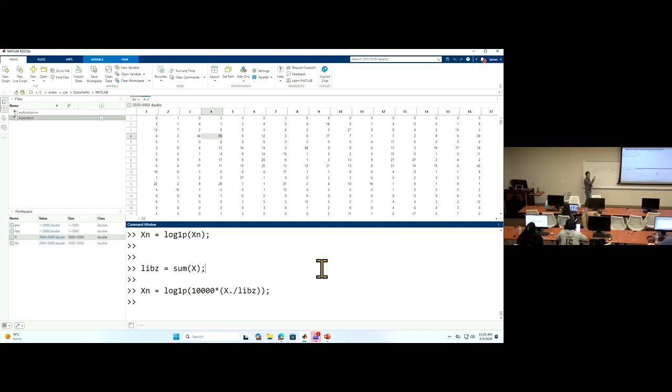Gene-wise, because the cell-wise average should not change, since we already normalized the total summation of each cell to be the same. So the mean for the cell for this normalized version means nothing, because all the cells have the same mean. But for the gene-wise, it's meaningful. So now we focus on this normalized version and compute the average gene expression.